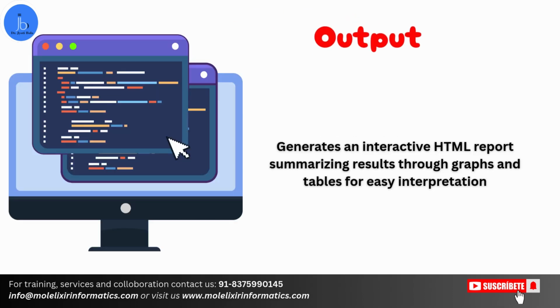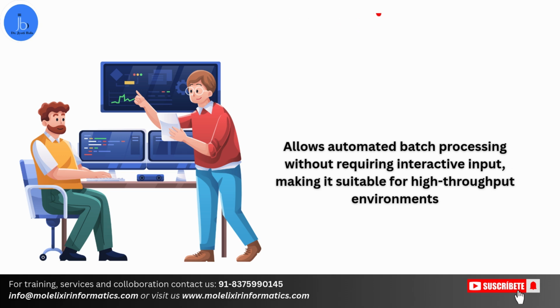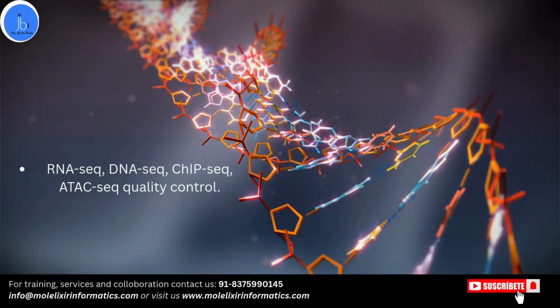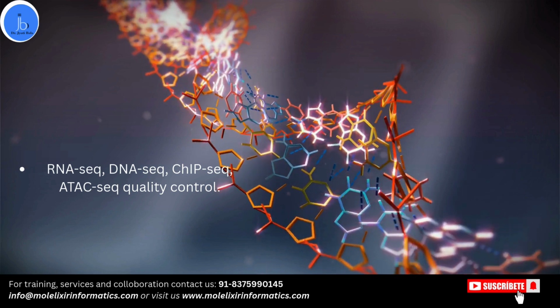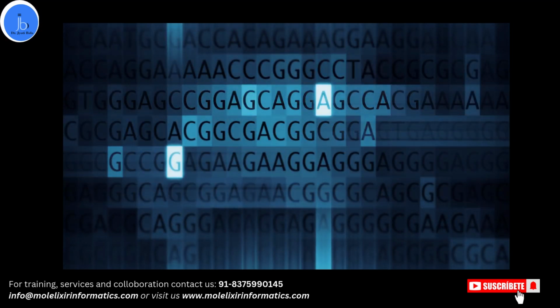In terms of output, it generates an interactive HTML report summarizing results through graphs and tables for easy interpretation. It also allows automated batch processing without requiring interactive input, which makes it suitable for high throughput environments. In terms of application, it can be utilized for the analysis of RNA-seq, DNA-seq, ChIP-seq, and ATAC-seq quality control. It also helps in identifying contamination or systematic errors in a sequencing run.